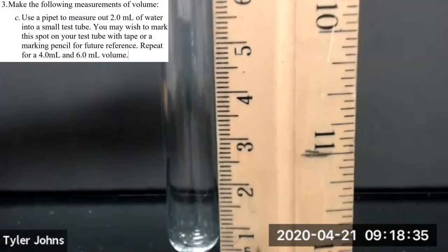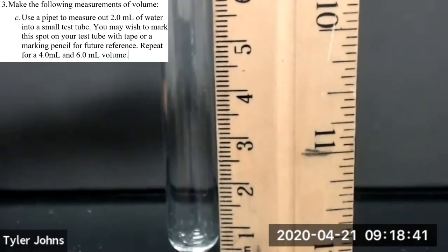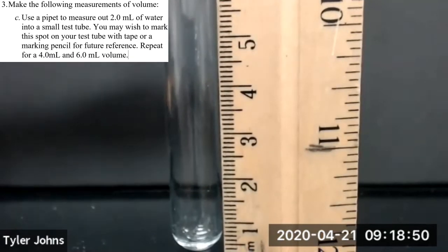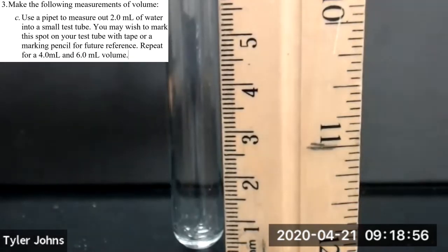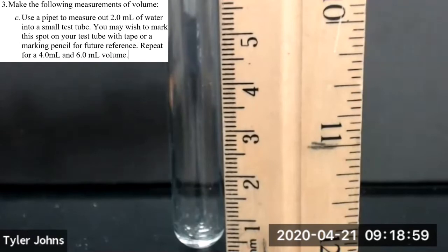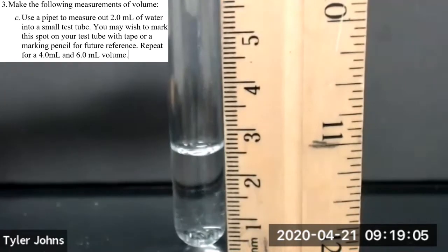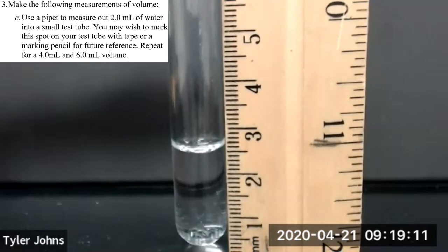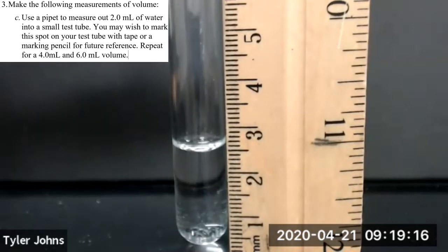Okay, so for part C of number 3 of our measurements lab, we're going to be adding 2 milliliters at a time up to a total volume of 6 milliliters to our test tube. And we're going to be looking at what length that takes of our test tube. So we're going to get 2 milliliters. This is our first 2 milliliters. So that's our first 2 milliliters of water added to our test tube. And then we're going to do our second 2 milliliters.